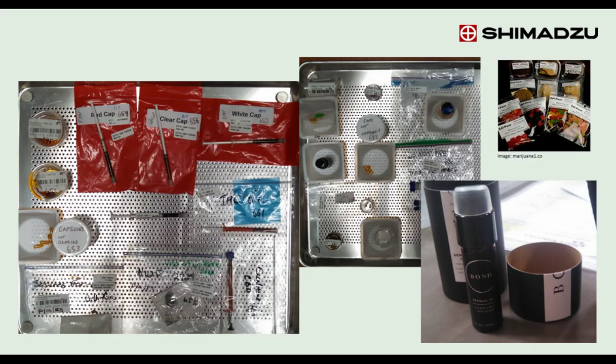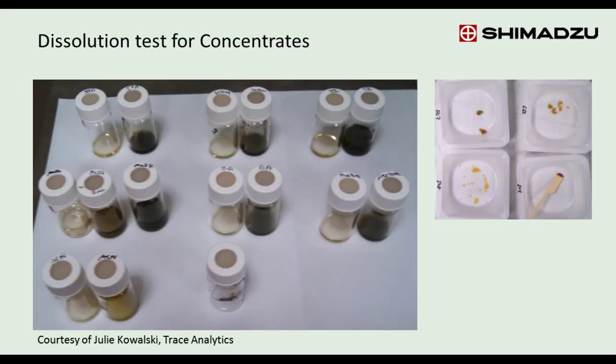We also tested a wide range of other types of concentrates, and there's various pills and powders and oils. This is a representative selection of what we've tested. So the first step in the analysis is to dissolve the sample. So we found after doing a dissolution test that methanol was the most effective solvent. And for nearly all of the different types of concentrates, we found methanol was very good at dissolving all of the cannabinoids and all of the solid material. And so we use this as the first step of our pesticide analysis for concentrates.